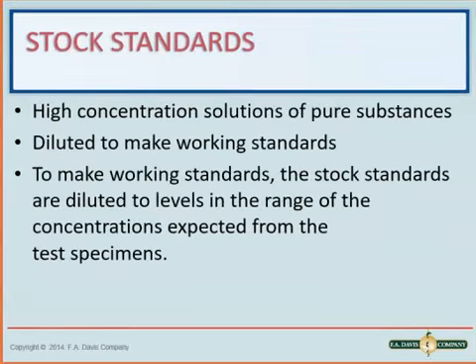A stock standard would be a highly concentrated solution of pure substances. That's the key, pure substances. You can make your working standards from your pure stock standard solutions. So maybe when you're ordering in a lab, you can order stock standards, and then you can make the actual working standards that you're going to use with your instrumentation from your pure stock standards.